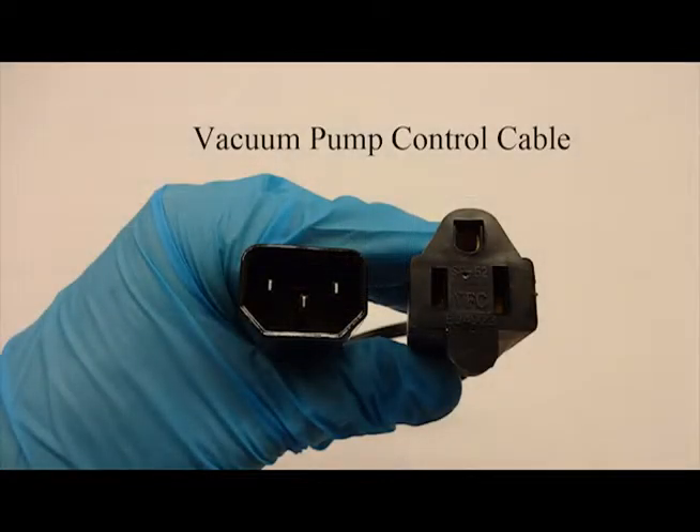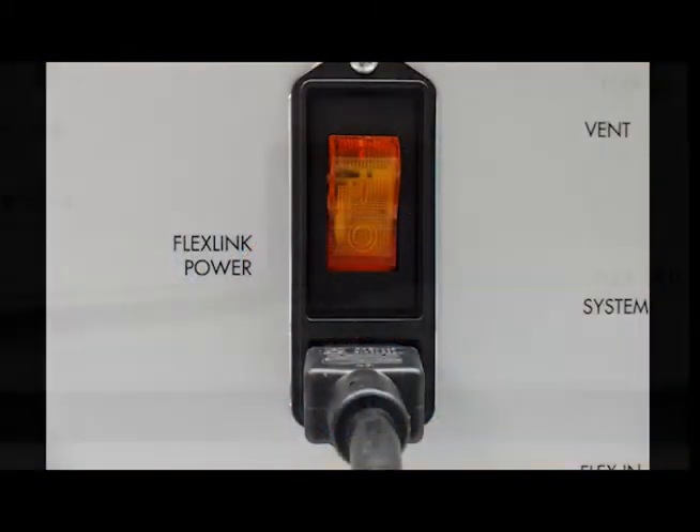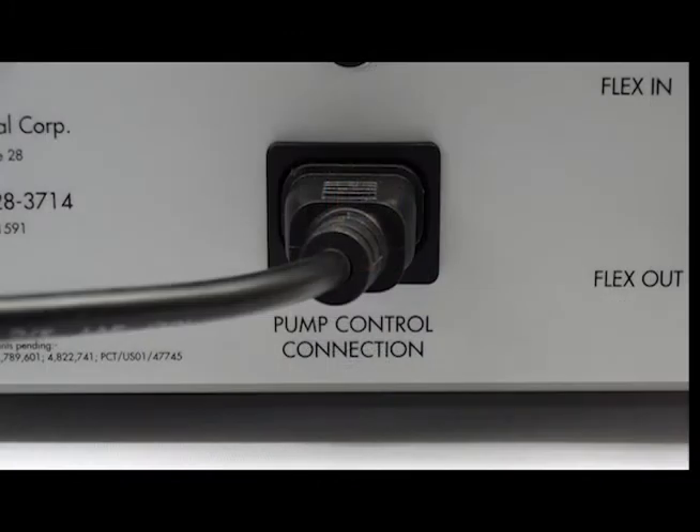Note: the pump control cable might not be compatible with the plugs of your country. If this is the case, please purchase a suitable replacement cable. Your FlexLink power cable and pump connection cable are now connected to your FlexLink.